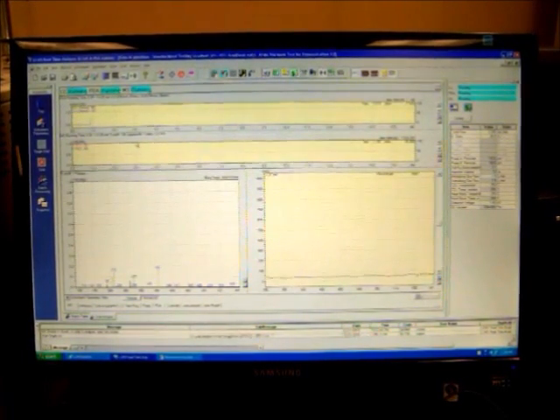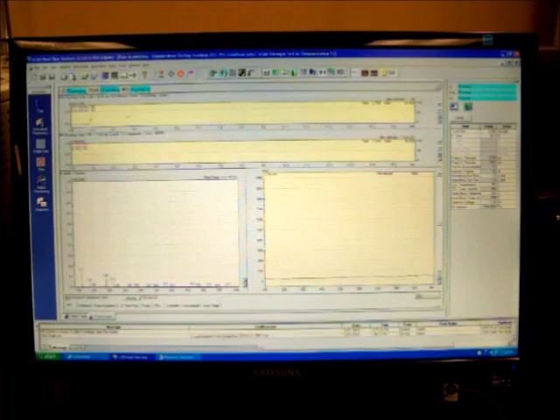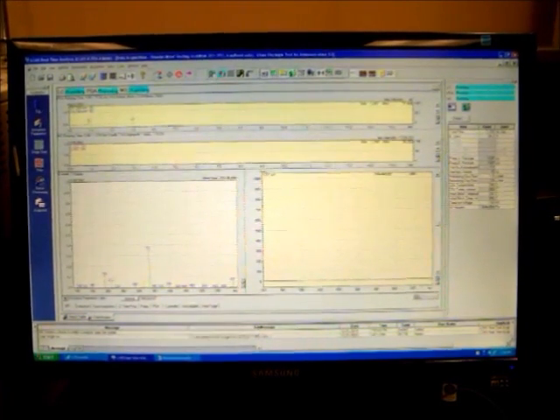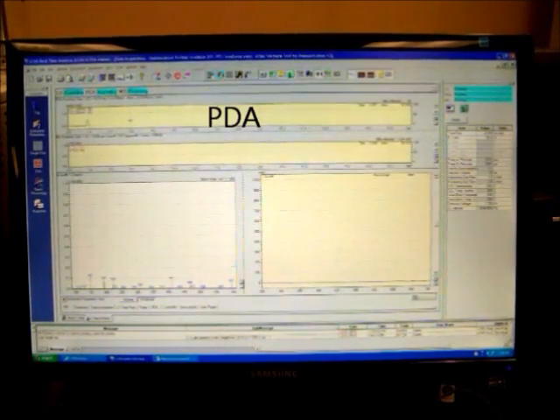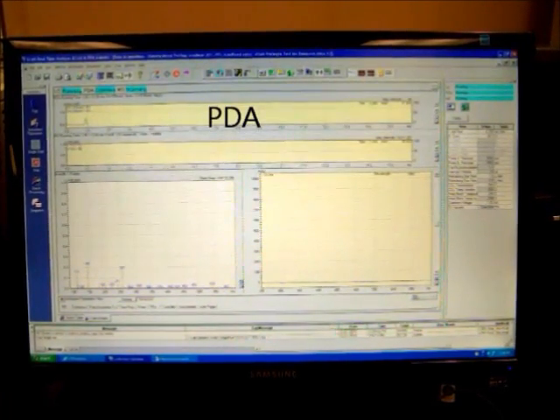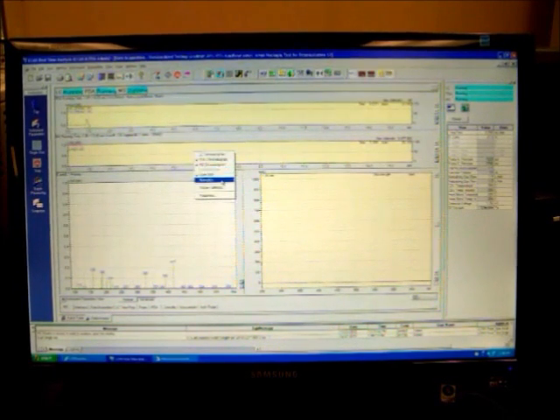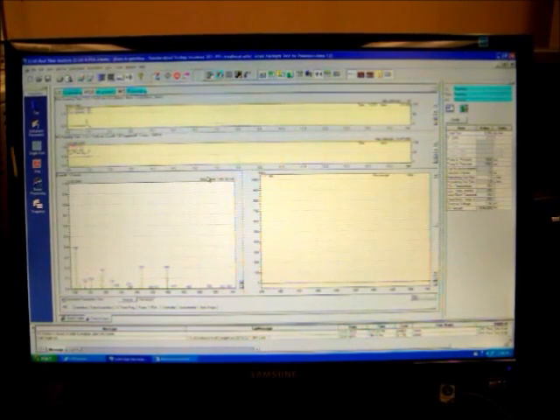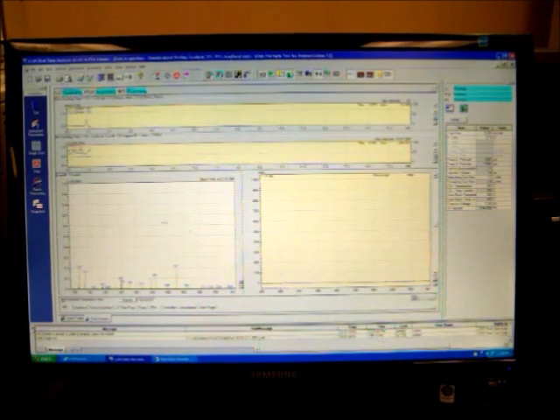The top screen indicates the PDA, what is being detected through the instrument. This screen indicates the mass spec, if there's any material coming through the mass spec.